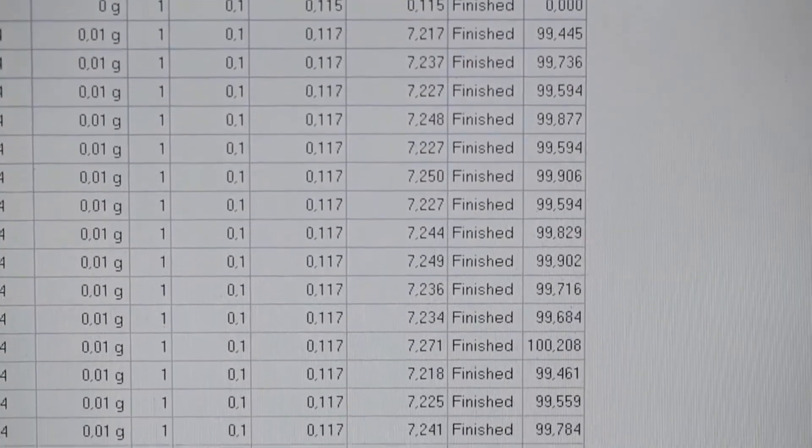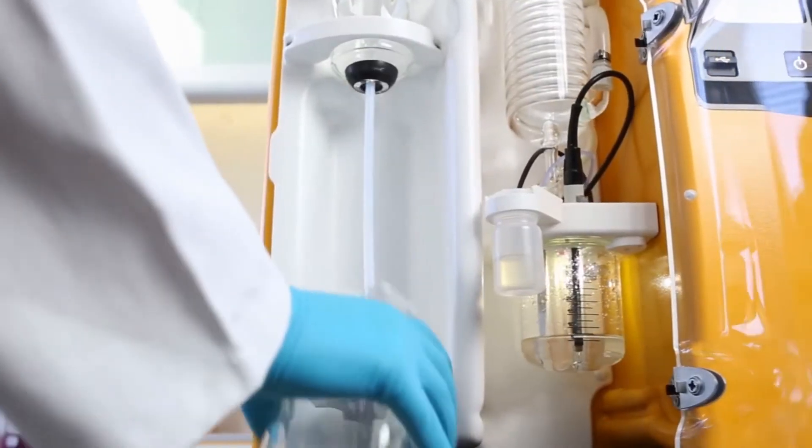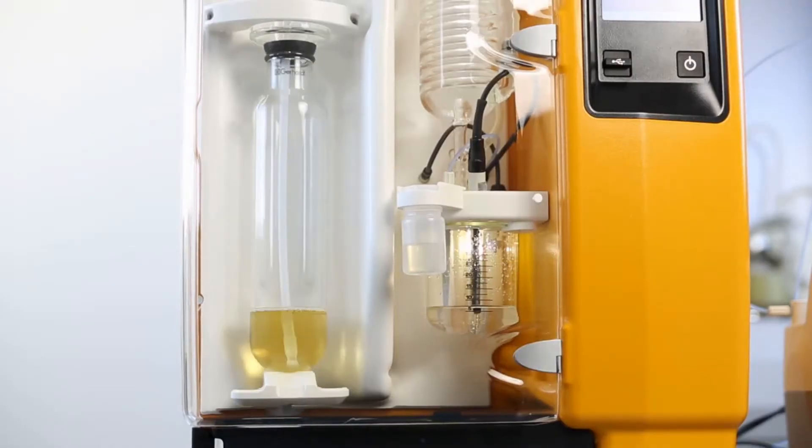Another great VapoDest feature is that all devices can be operated with a variety of Kjeldahl digestion tubes and sample reservoirs.